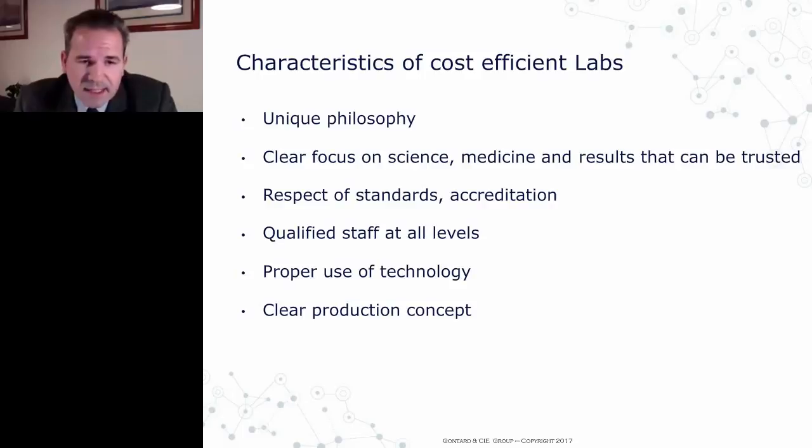That means, are you focusing on 1 or many tubes? Are you patient-centric or are you request-centric? Do you have a unique patient number? Do you have a unique barcode number? Do you have a unique tube per machine or per department? Or do you aliquot? Do you have a clear production concept that is applied through all your production sites in the group of laboratories, or do each laboratory potentially produce on a different technology, on a different platform? Do you have the capacity to reintegrate all these results into 1 single LIS, or do you have multiple LIS? Do you have multiple LIS and a unique middleware?